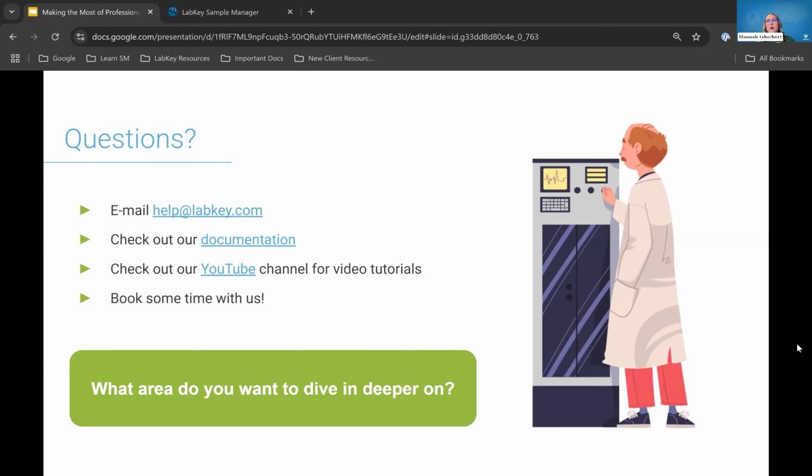I can maybe speak to this a little bit. We definitely don't have this functionality built out. I haven't heard of this scenario before, but I can imagine it's a way to prevent some redundancy, or to have some redundancy, not prevent some redundancy. So I think that's certainly interesting as a potential thing for us to consider. As mentioned in a different Q&A while Lance was presenting, that type of business logic is stuff that we're really trying to build out into our workflow functionality in LIMS this year. So certainly a good scenario for us to consider.